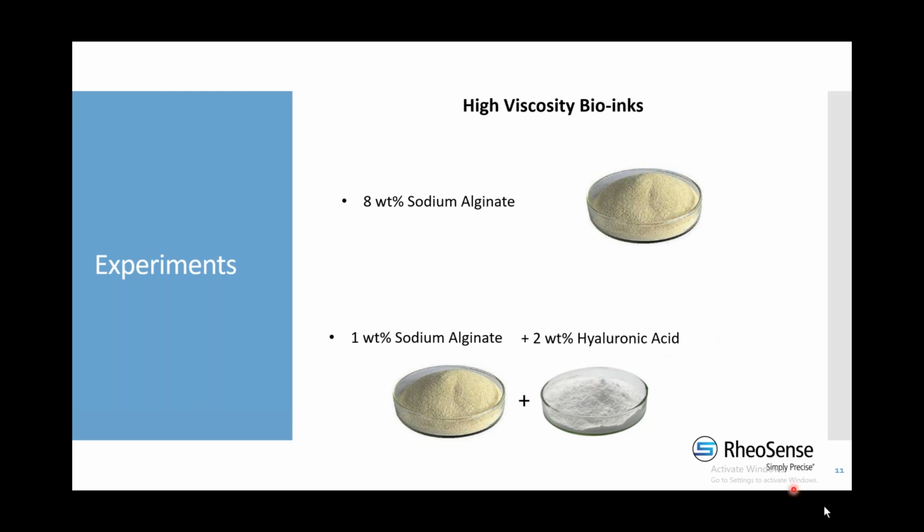So for the second set of our experiments, we examined extensional viscosity of bioinks. The goal that we had was to show how we use our e-VROC technology to measure extensional viscosity of bioinks over a broad range of shear rates, extensional rate. So we used multiple chips to test a broad range of extensional rates using just one instrument.